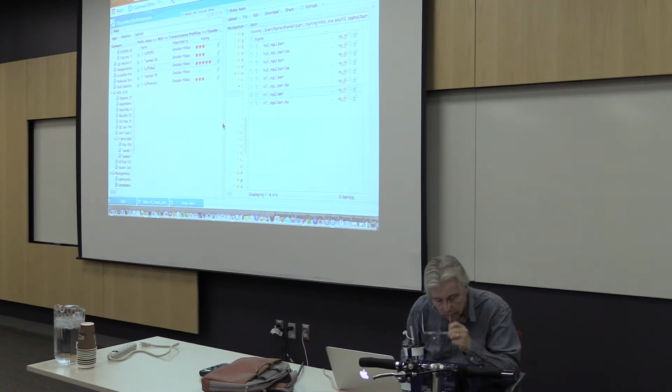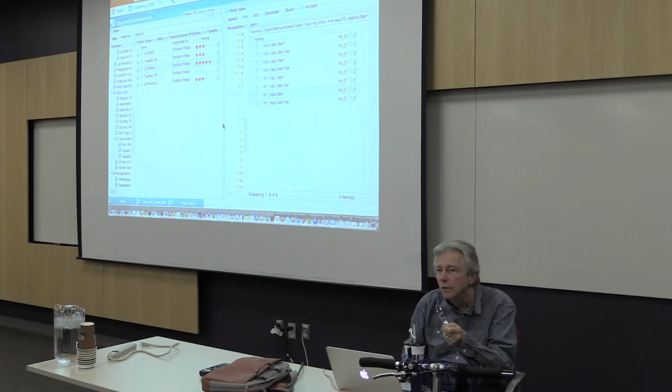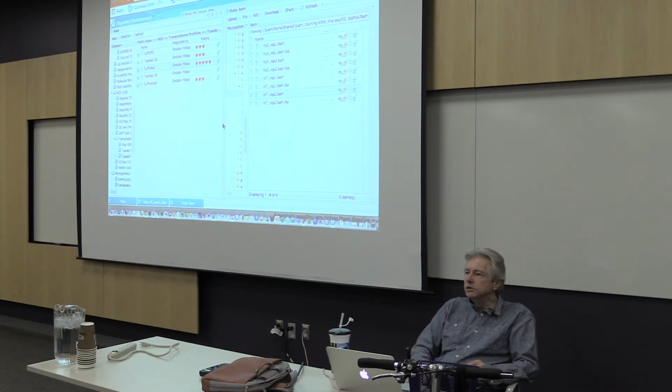Well, again, it depends on what annotation information is available for your genome, or what is produced by the software that you may use to produce the annotation if you're doing it yourself. I think that Maker, for example, which is a program that can do this, can produce a GTF file, but I'm not sure. It can at least produce a GFF file for you.